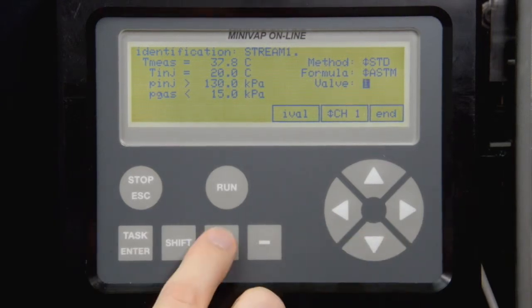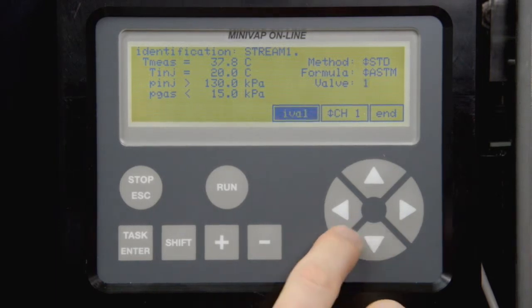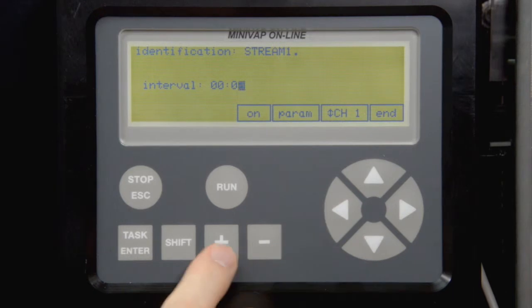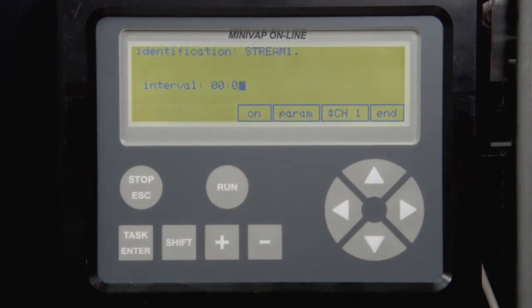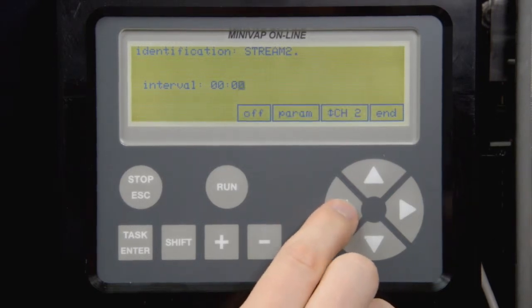Next, select the valve you want to use for this channel. Select IVAL to define the measuring interval. For a standard gasoline measurement, a 7-minute interval is required. For a V over L test, a 10-minute interval.